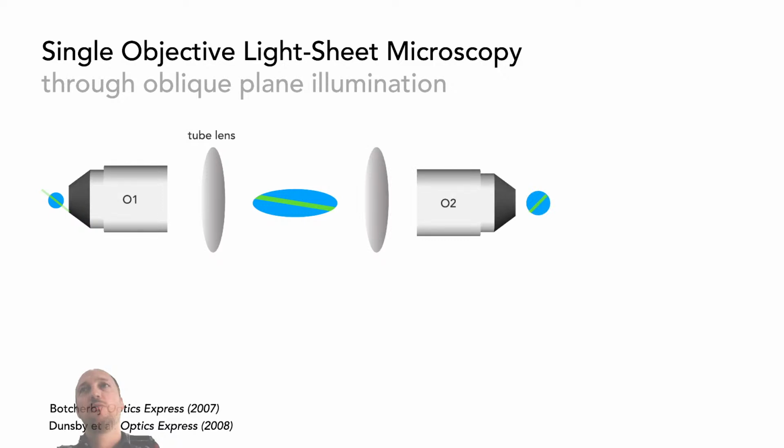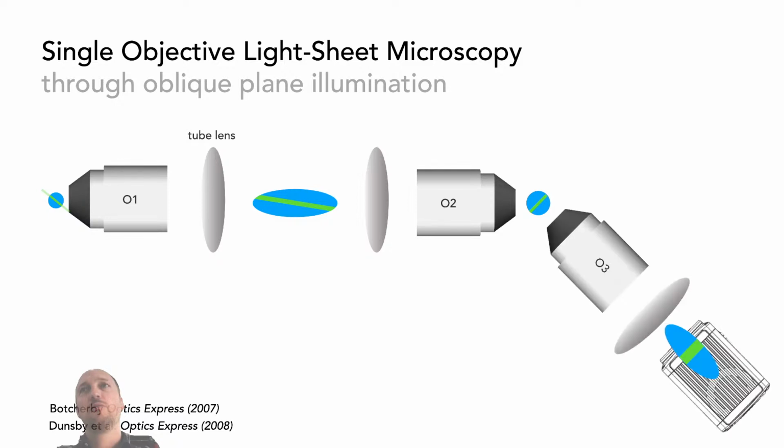It's just not possible. So what you can do instead is put another microscope in some sense, but this time that would undo the effect of the first one, and you can recreate the light distribution of the sample, and that light distribution now is purely virtual. There is no object there. It's similar to what happens between the two glasses. But the beautiful thing here is that you can put a third microscope in some sense that will then be imaging at an angle. And you can't possibly do that with the original sample because there's already an objective there and so the two objectives would collide. But by using this trick called remote focusing, we can recreate that sample virtually and then re-image it.